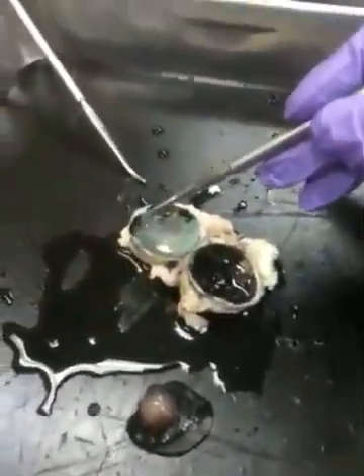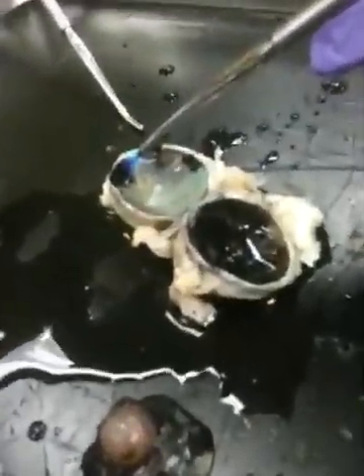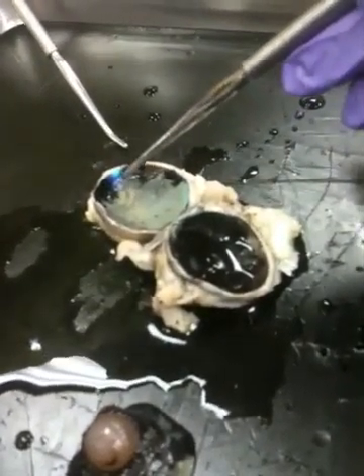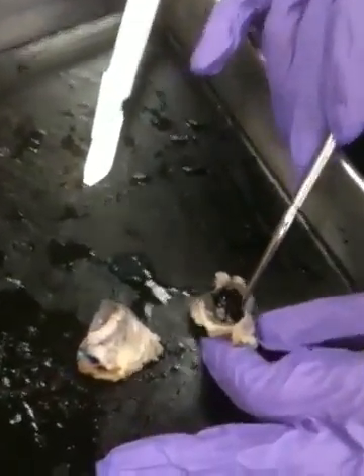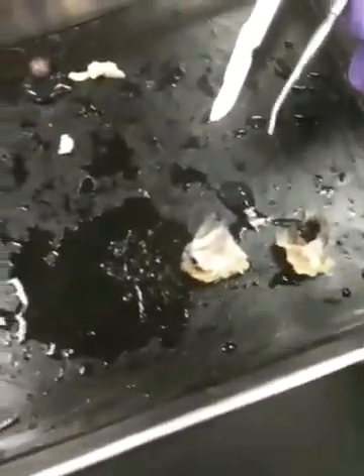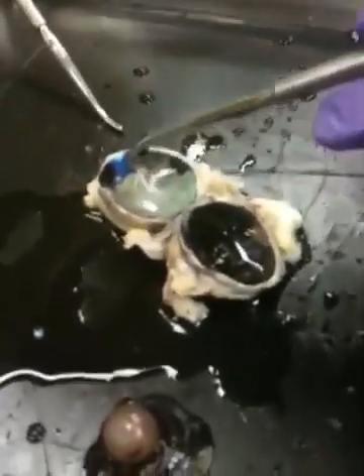Okay, so once we start to move this, you can see this, what looks little iridescent, like the inside of a conch shell or something, or black. That's the choroid. The choroid is usually described as a really dark layer, and you can see it here as well. You can see that dark layer. And remember, that's dark because it's going to absorb any excess light that comes in, so the light doesn't just bounce around and around your eye, and then you get confused and you don't know where anything is. This weird shape, just informationally, someone asked about it one time.